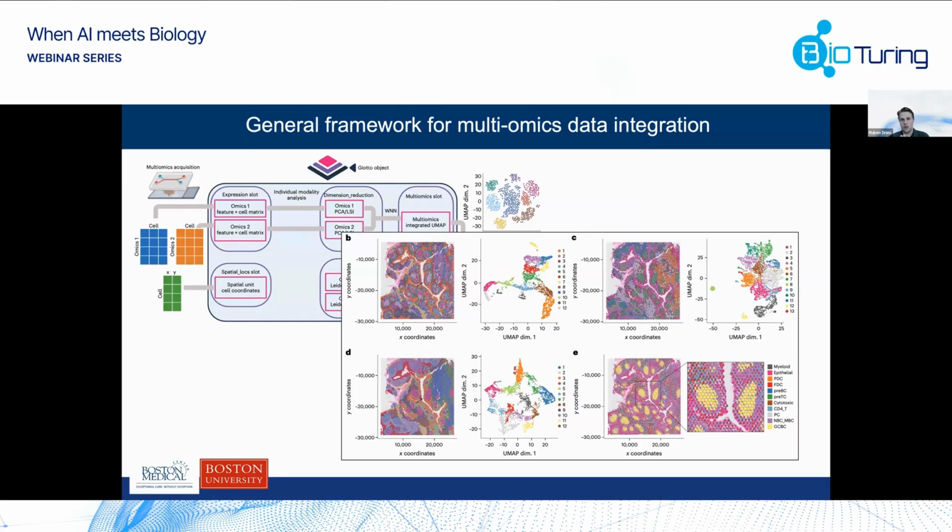I would argue, and we have these 3D data, that if you go 10 micron or 5 micron, depending on the technology, the tissue structure and even the cells are almost identical. Oftentimes you even capture the same cell. So I think that is a valid approach. You just have to think about whether you are capturing the same cell or a slightly different cell, but I think even that is something you can take into account and address.